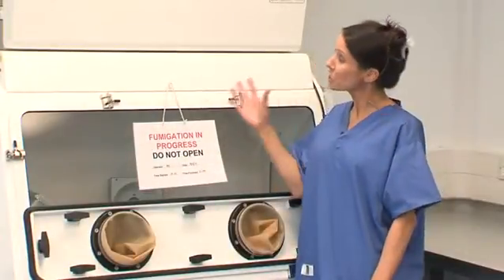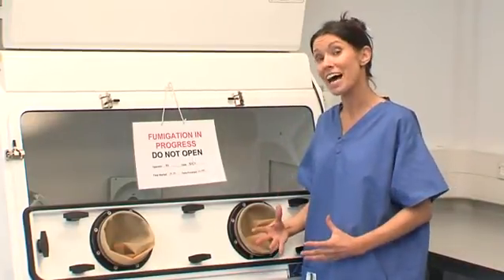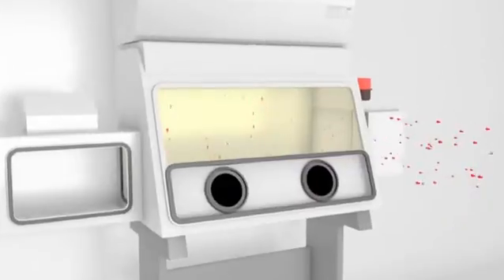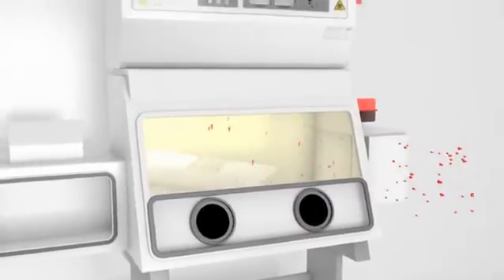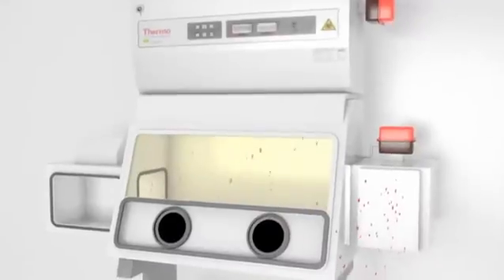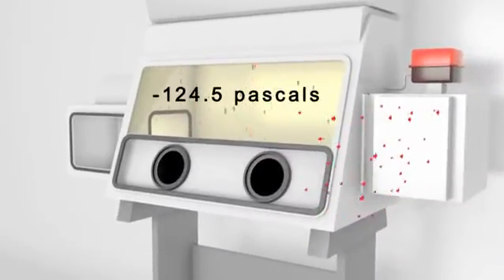The class 3 biological safety cabinet provides the highest level of protection for personnel and the environment. The cabinet itself is a completely sealed airtight unit. The air supply is HEPA filtered and the exhaust air passes through two HEPA filters. Air flow is maintained by a dedicated exhaust system outside of the cabinet which keeps the cabinet interior under negative pressure around 124.5 pascals.